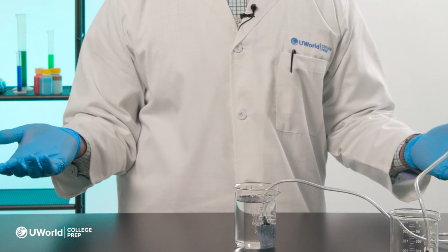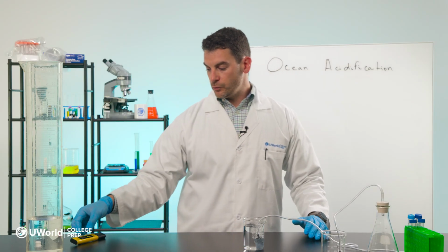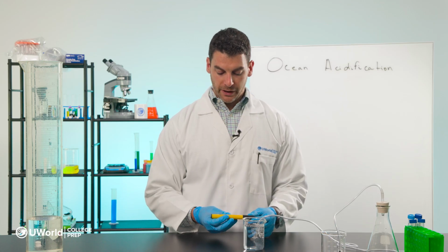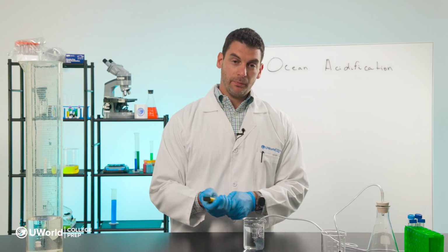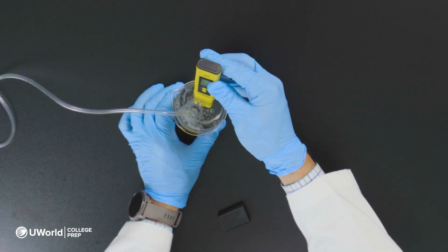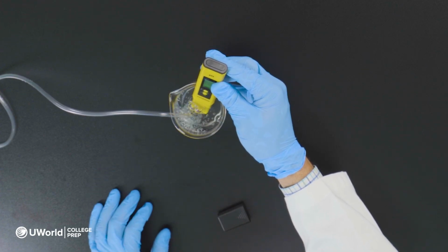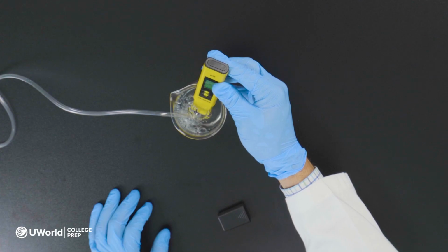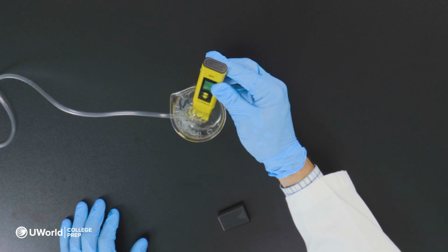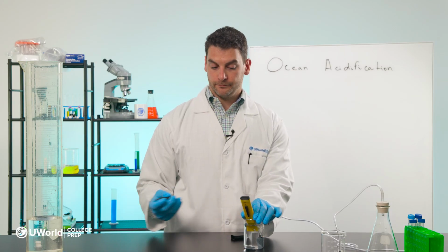This will be used as a control because instead of pumping carbon dioxide into our distilled water, we're just pumping natural air. So with this first experiment, we are going to test the pH of it using our pH meter. And we are going to take a pH reading for about 2 total minutes to see how regular air changes it. So once you have your pH meter submerged in the liquid, wait a couple seconds until your reading flattens out. And then using the stopwatch, you can time that.